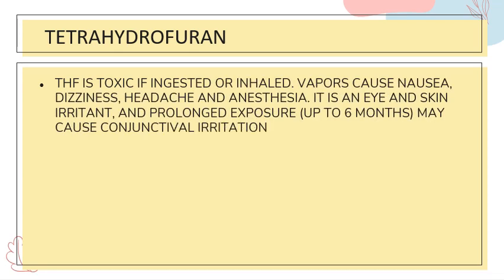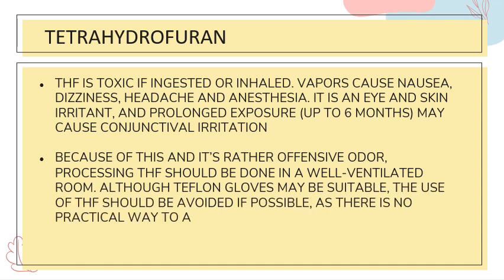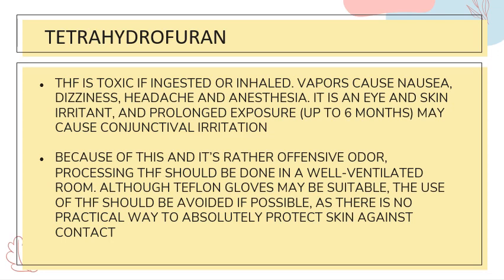Although the disadvantage is that THF is toxic if ingested or inhaled, vapors cause nausea, dizziness, headache, and anesthesia. It is an eye and skin irritant, and prolonged exposure of up to 6 months may cause conjunctival irritation. Because of this and its rather offensive odor, processing with THF should be done in a well-ventilated room. Although Teflon gloves may be suitable, the use of THF should be avoided if possible, as there is no practical way to absolutely protect skin against contact.